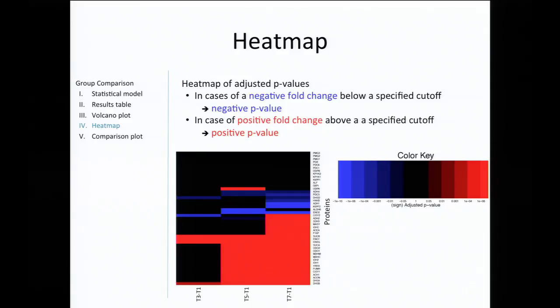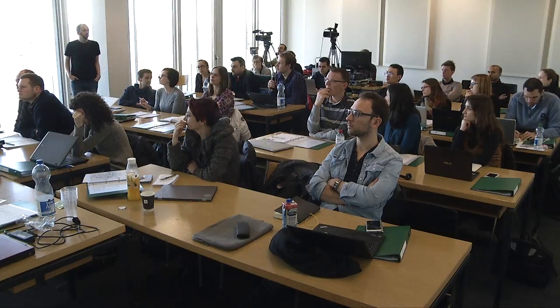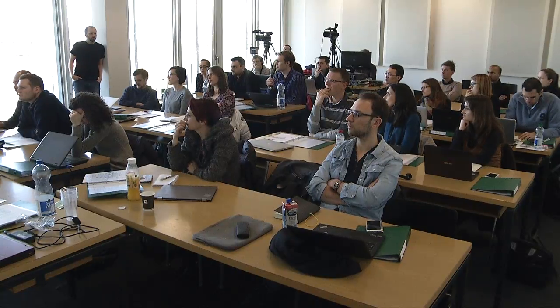If you have multiple... I'd like to ask, maybe you can comment how you calculate p-values and what statistical tests would you choose for different experiments? So the p-value is basically calculated from those linear mixed models that are built in this concept, right?